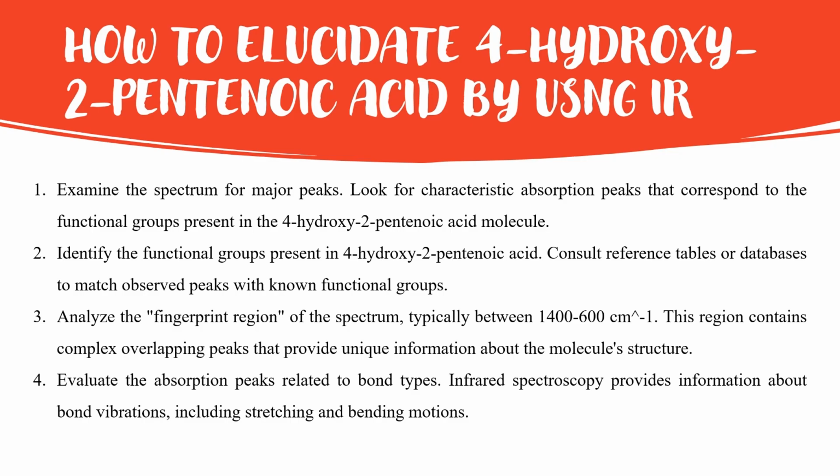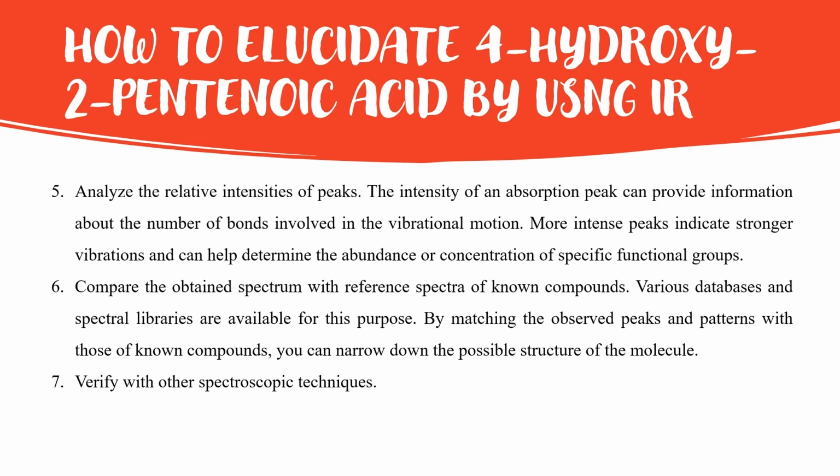After that, evaluate the absorption peaks related to bond types. Infrared spectroscopy provides information about bond vibrations, including stretching and bending motions. Next, analyze the relative intensities of peaks. The intensity of an absorption peak can provide information about the number of bonds involved in the vibrational motion. More intense peaks indicate stronger vibrations and can help determine the abundance or concentration of specific functional groups.